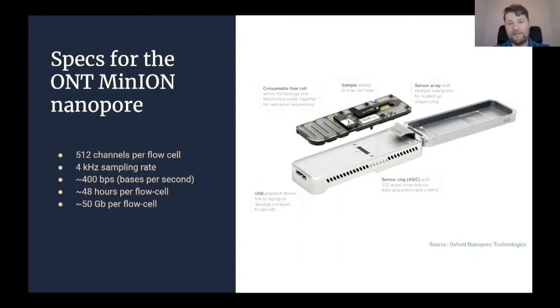And it is actually possible to wash and reset this flow cell. It works a little worse the second time, but you can run it a couple of times and then it's spent. You have to send it back to the company and they can actually replenish it.